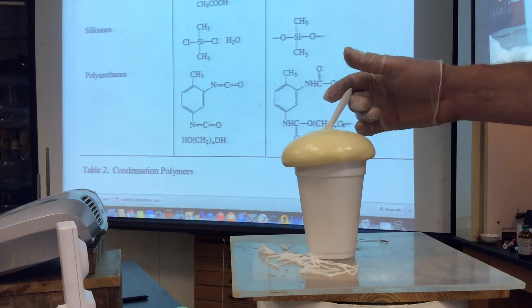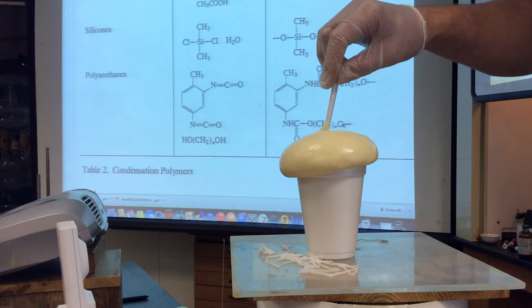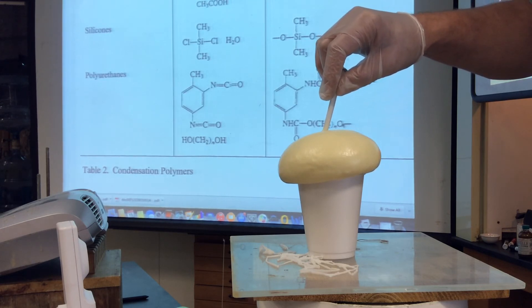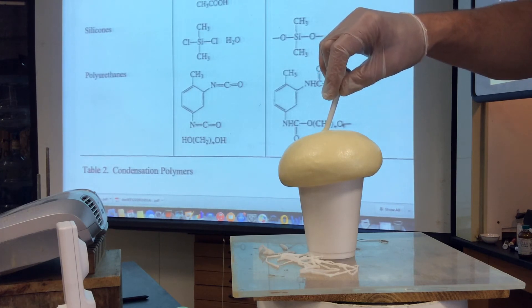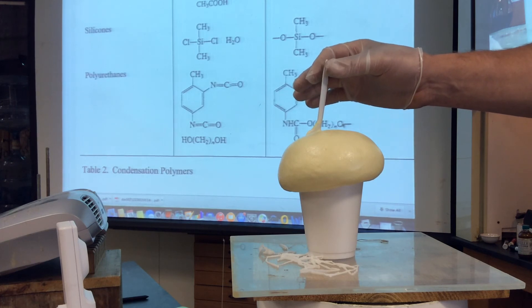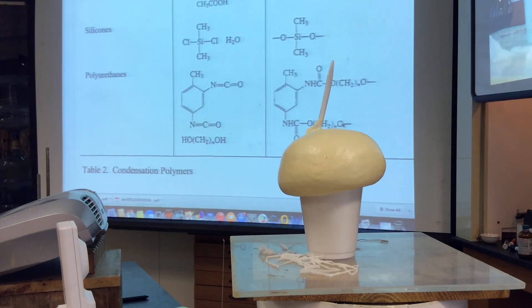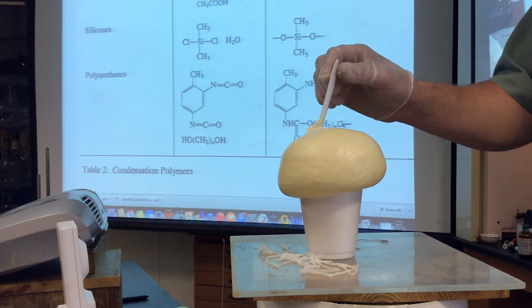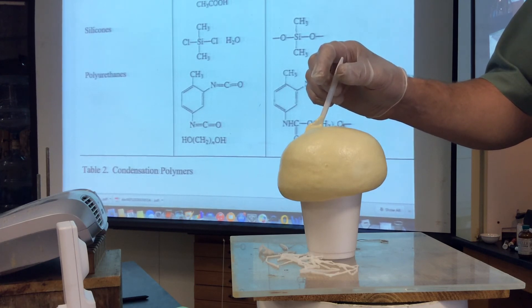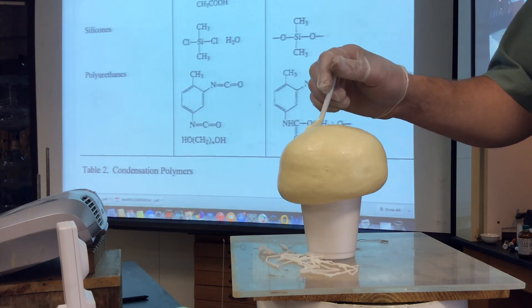I'm just trying to create this shake that's gone awry, maybe, effect. What's the spoon doing? The spoon is, you're going to see that, hopefully, in a second. As it's still oozing. Now, it's giving off heat as the polymerization goes by, and, of course, it's giving off water vapor, too. What's interesting about this polymer is that once it gives off its heat and cools, it cools into a relatively hard polymer. In fact, they use this, called a polyurethane foam system, to fill in gaps, let's say, in insulation. Oh, is that what my foam is? That's what that stuff. Yeah, exactly what this is.